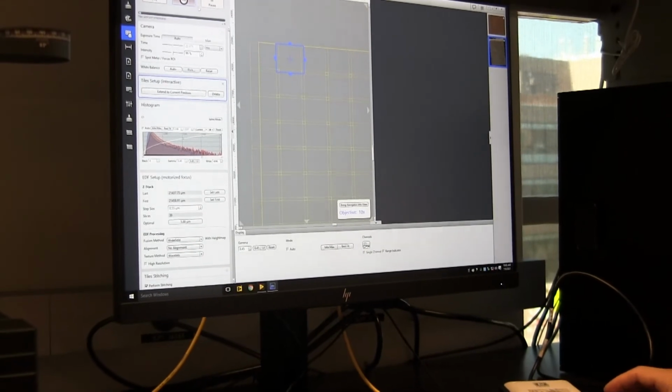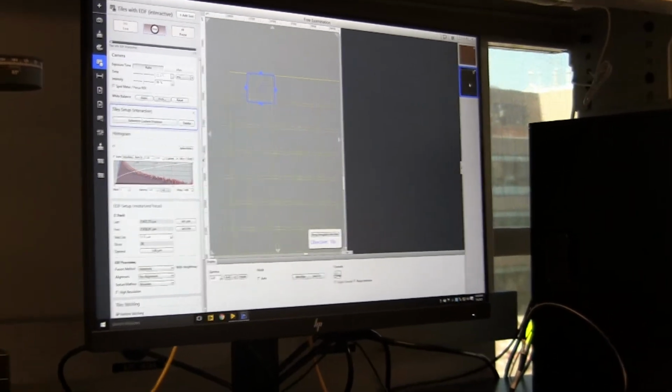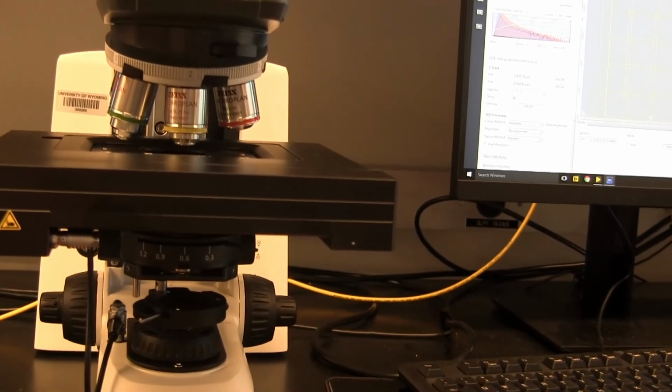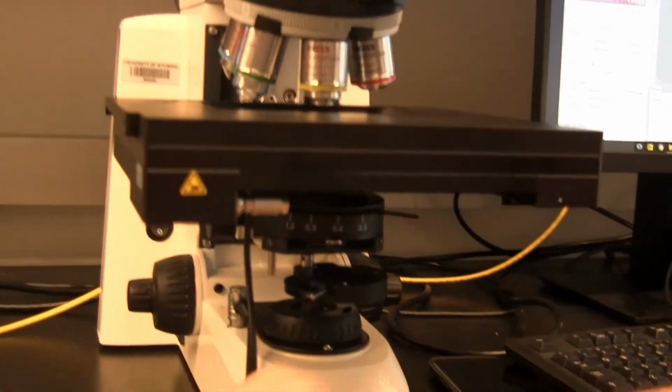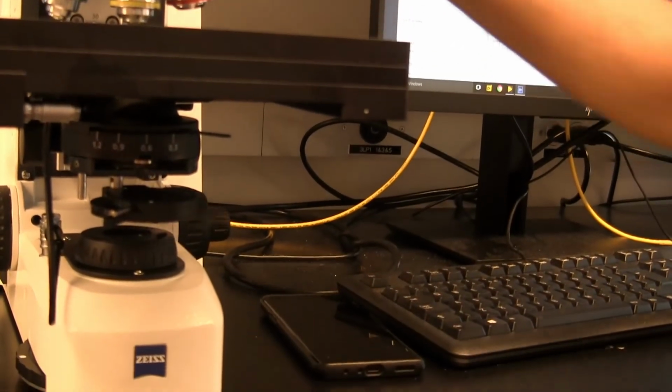And I think that's it for the optical microscope. After you finish, just make sure to close the software, turn off the microscope from the same button, bring the cover, put it back on here, and then cover it with the dust cover, which is this one. Cover your microscope with it, and that should be it.